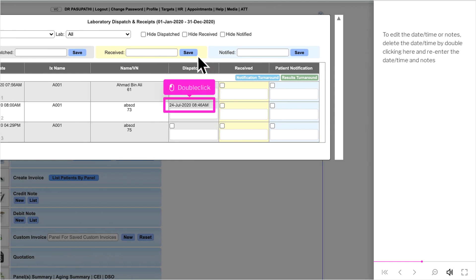To edit the date, time, or notes, double-click here to delete the date and time, then re-enter the date, time, and notes.